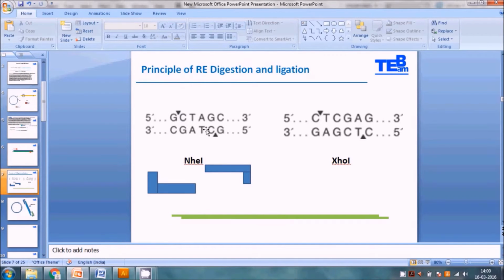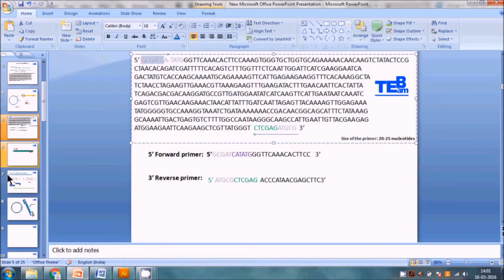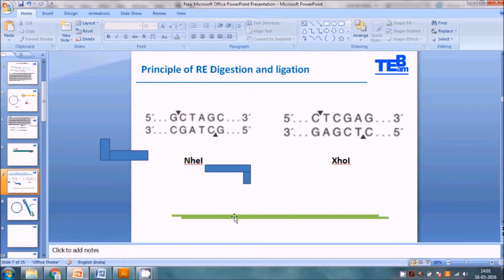Okay, in this part, as we remember, on this side we have some fodder region. For the reason, I'll explain this here. For example, here you can see the sequence. This GCGC we just added as a fodder sequence. So once we cut, it will cut one portion like this complete, and it will cut another portion like this. So this will be just removed. One side which is free will be removed, and then you will get these kind of sticky ends. So we will use this one. This is discarded, so only this one is needed here. The same applies to XHO1.